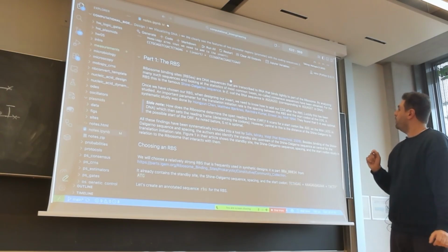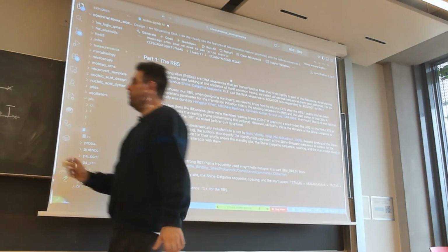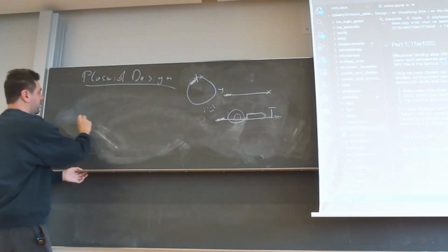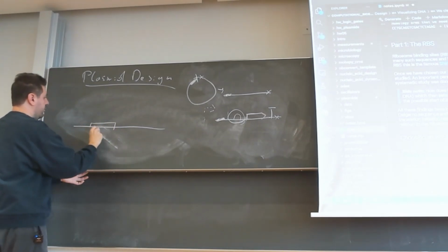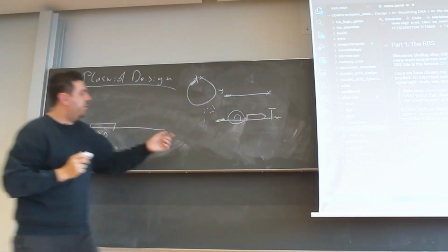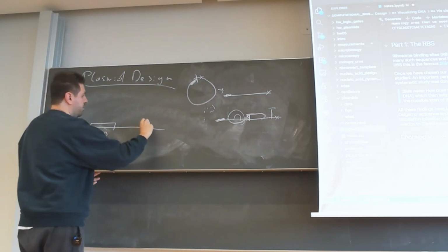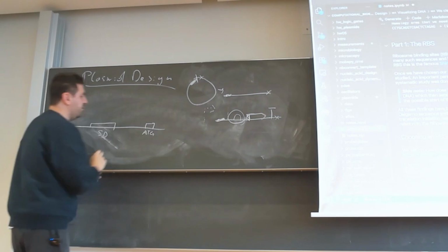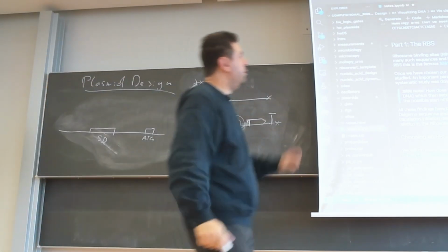So that tells us we have to have this consensus sequence. We are now zooming into this here. We have this Shine-Dalgarno sequence. Then we have to have a start codon. I'm writing this now in DNA, so it would be AUG in RNA and ATG in DNA.